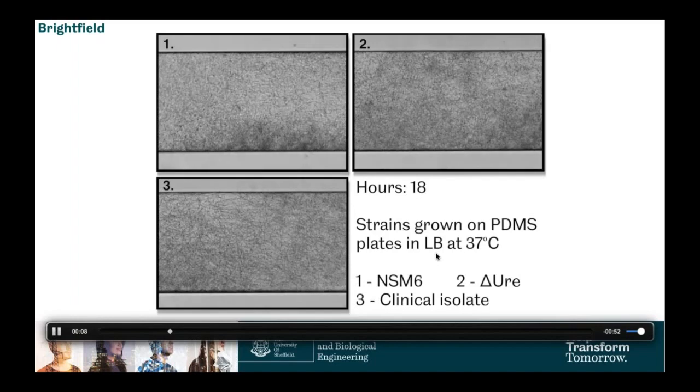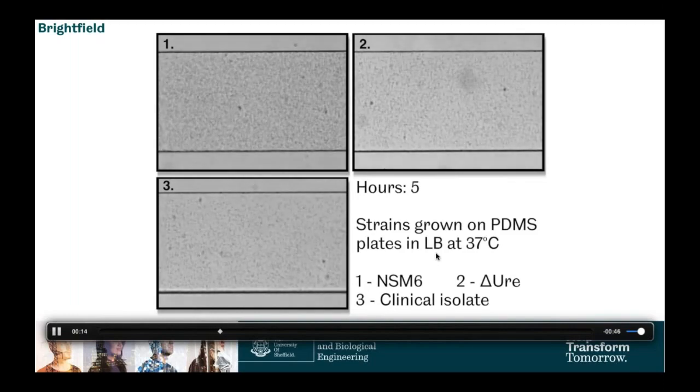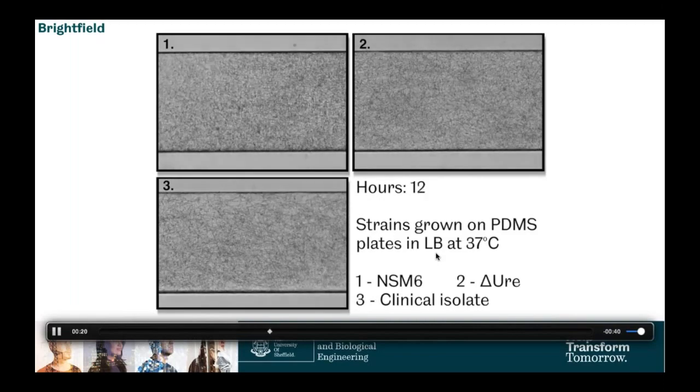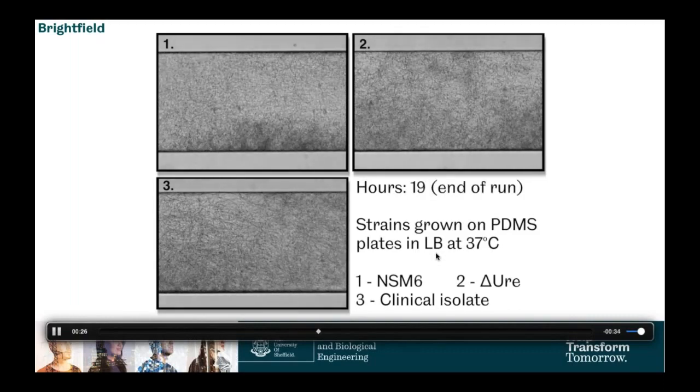There's a slight loss of detail as we're transmitting over the internet, but when you're looking at these images, you can see a lot of detail in there. There's a real distinct shift in morphology. With Proteus, you see a change from swimming cells to swarmer cells, and they become much more elongated, and they have this distinct stringy quality. You see that really clearly, as well as the formation of these thicker structures. Down here in channel number one, on the near wall, there's a thicker structure there, biofilm forming. And there's also a flow channel forming in channel three as well, which you'll see a little more clearly in a minute.